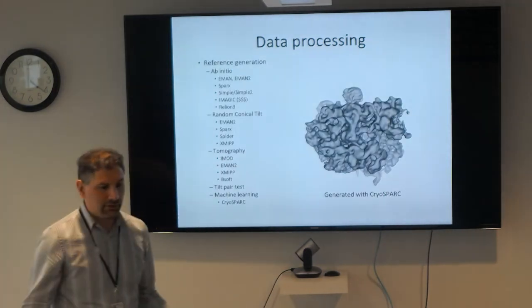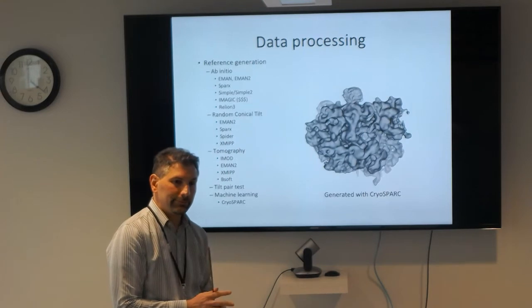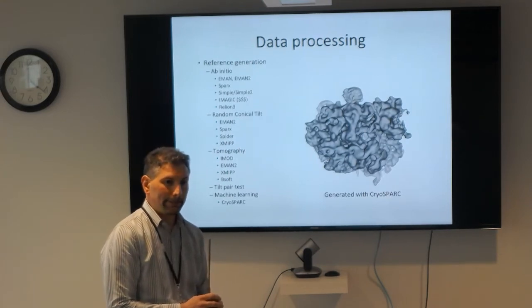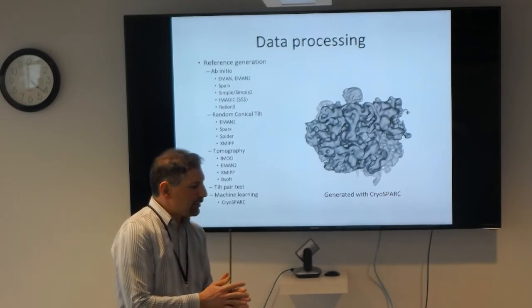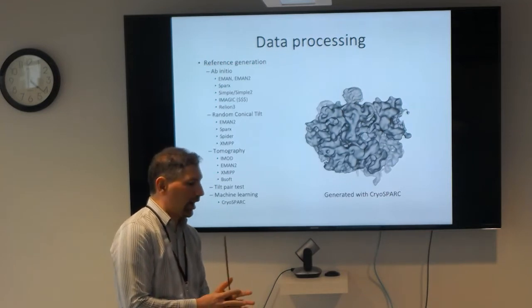And then, obviously, you want to go, yes? So, Yoke was talking about how Spider is how he learned to use single particle analysis. Is it used a lot in labs now? Or is it dying? I wouldn't say anything is dying. So Spider, I wrote a lot of routines for Spider.